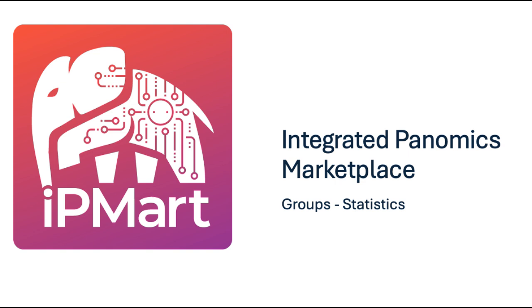Note that all plots are saved as they are made and can be downloaded in the Download tab. See the Download tab video for more information.